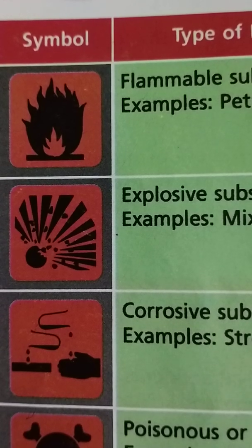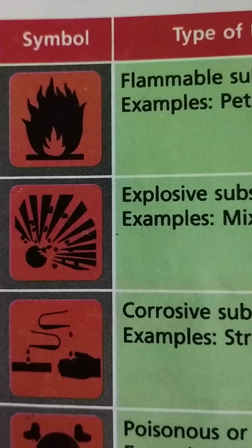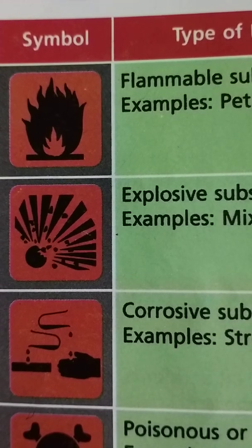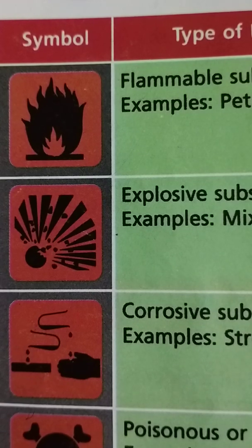The first symbol is used to label the flammable substance. Flammable substances are all those substances which can easily catch fire. For example, petrol, alcohol, ether, kerosene oil, and spirit — they all are flammable substances. We must keep flammable substances away from fire or heat.